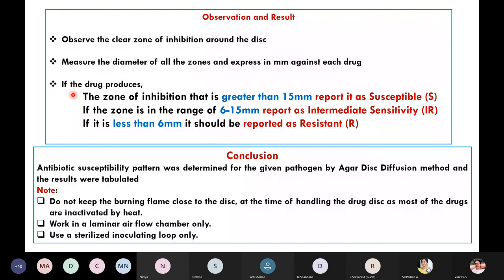If the zone of inhibition is greater than 15 mm, report that the organism is susceptible to that particular antibiotic. If the zone is in the range of 6 to 15 mm, report that the test pathogen shows intermediate sensitivity. If the zone of inhibition is less than 6 mm, report that the organism is resistant to that particular antibiotic. Draw a tabular column listing all antibiotics, measure the zone of inhibition with a scale, and note it down.